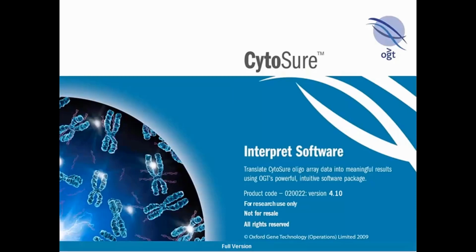Welcome to this video, which will guide you through the new Target Regions feature available in the CytoSure Interpret Software version 4.10 onwards. This feature allows the user to focus their analysis on specific regions of interest in the data, and by choosing to remove any unspecified regions, it helps to avoid the problem of what to do with incidental findings from the whole genome dataset.